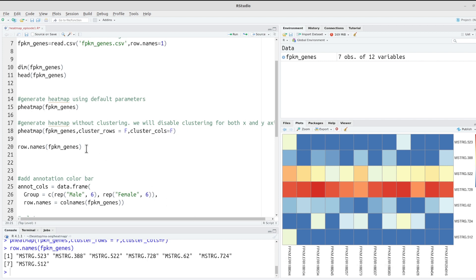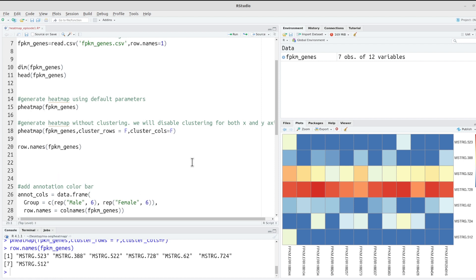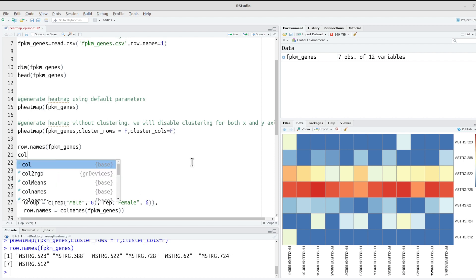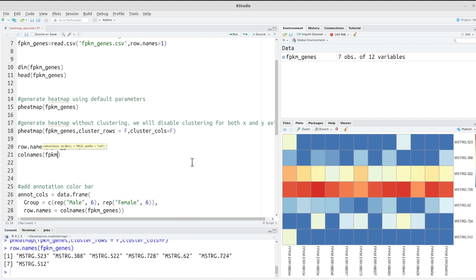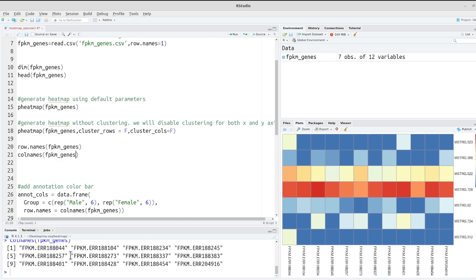Let's check the samples as well using colnames() on fpkm_genes. We have them here in the same order. So the key point is: if you don't want your genes or samples to be rearranged, just disable their clustering. You can also disable only one — for example, disable only cluster_rows — and the genes will not be clustered while columns still are.